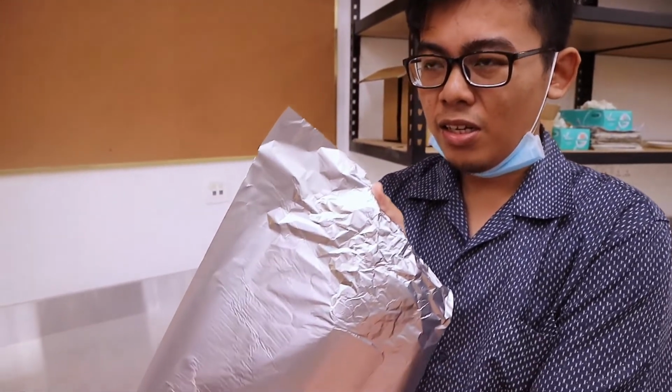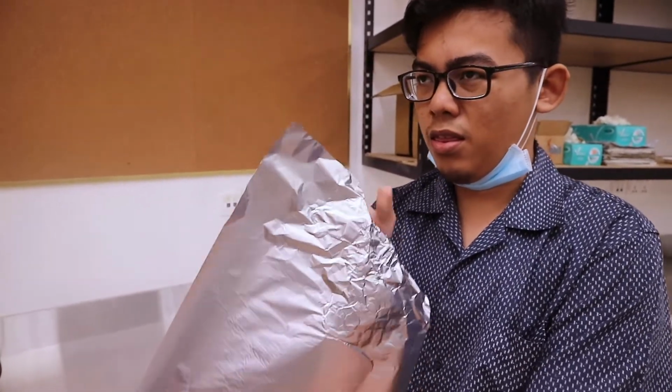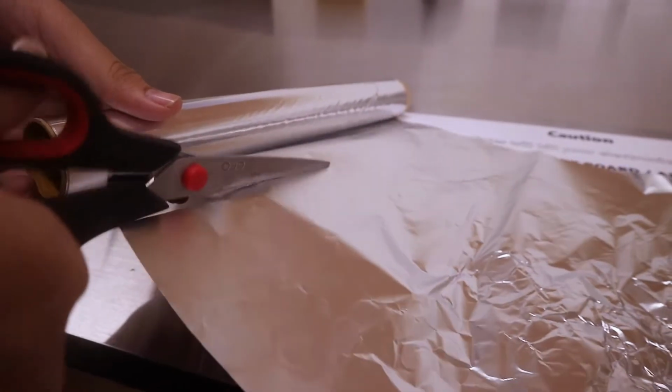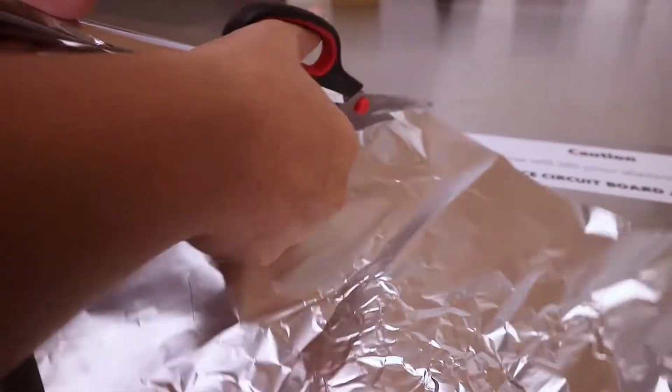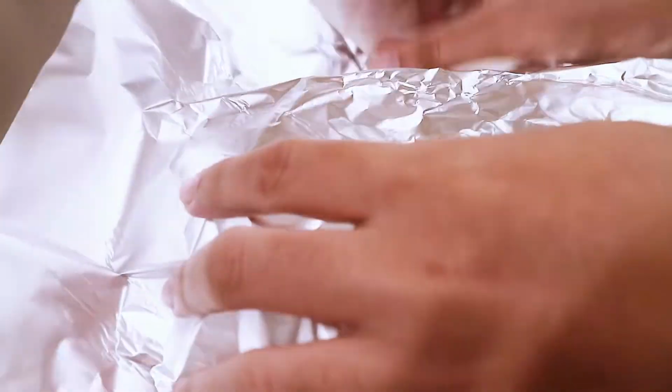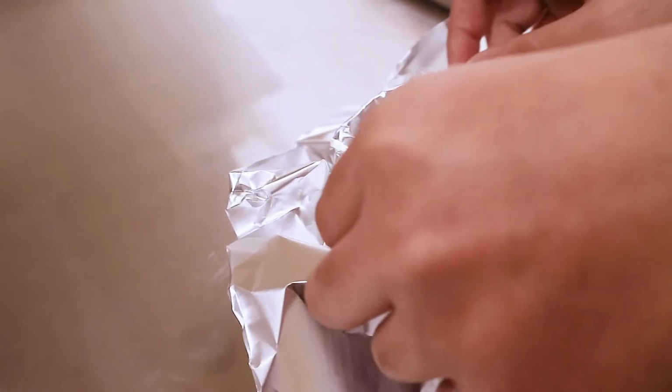The reason is this beaker does not have a lid, so we will use this as a makeshift lid. And then we put the beaker and the lid into this pressure cooker. We're cutting this out to make the lid for the beaker. Cover this. And make sure that you don't cover this too tightly so that some air can escape when the solution is boiled.